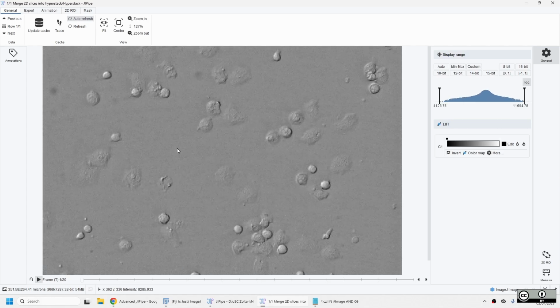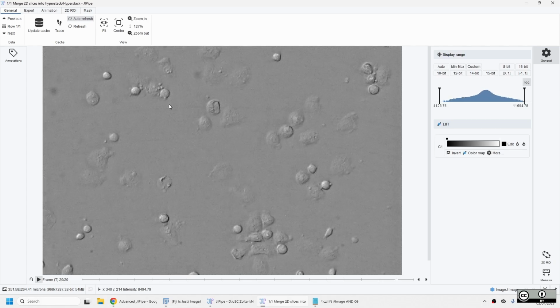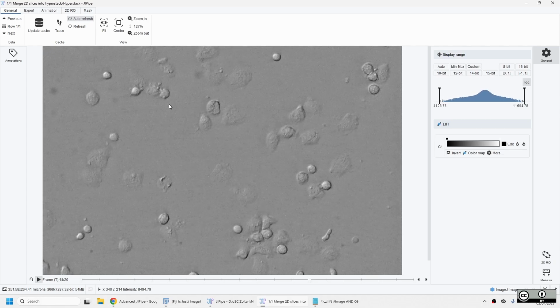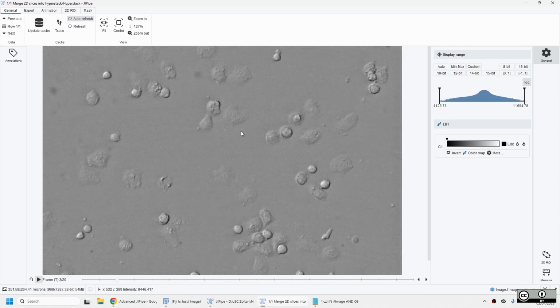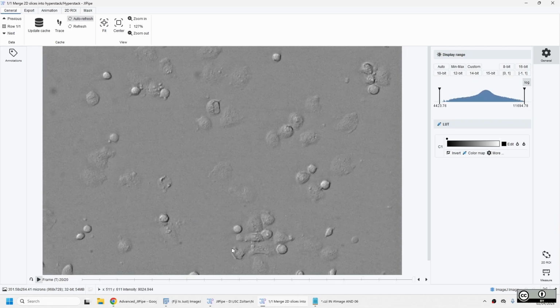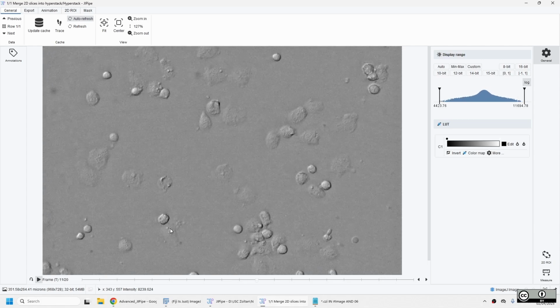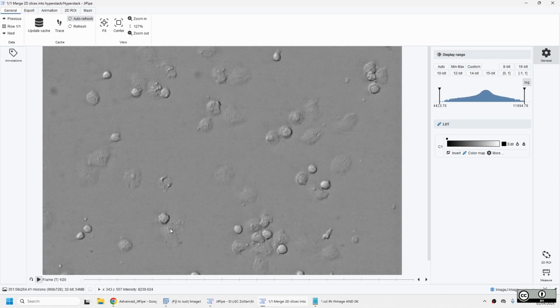As you see, and I would like to emphasize that again, this is a transmitted light image. It costs us exactly 0 to record them if you have fluorescence in addition to that. But with a properly aligned microscope, you will see a tremendous amount of details about these cells. And this is nothing special. This is just a confocal microscope, which in transmitted light mode is not confocal.